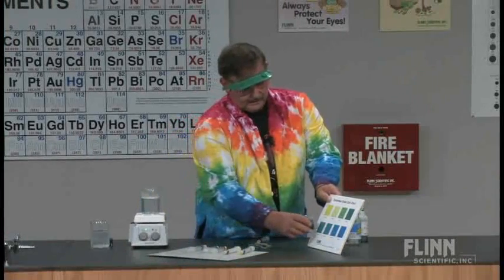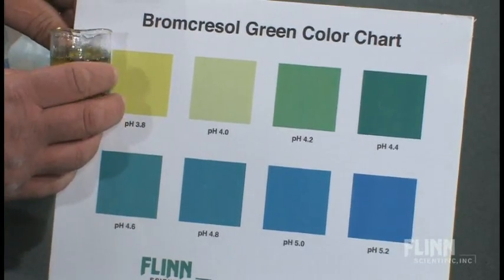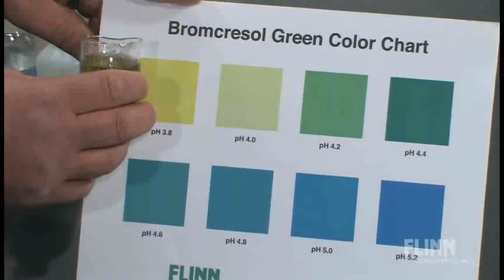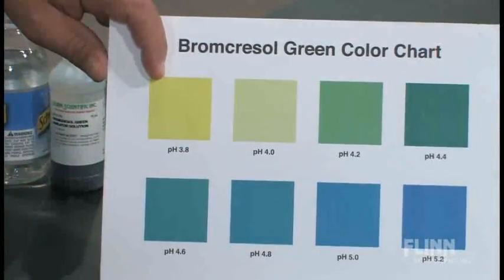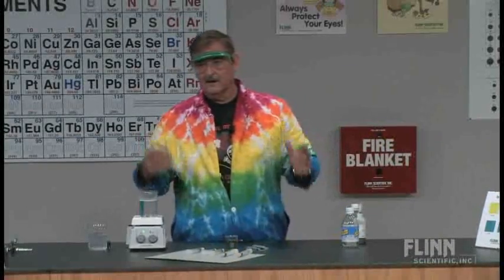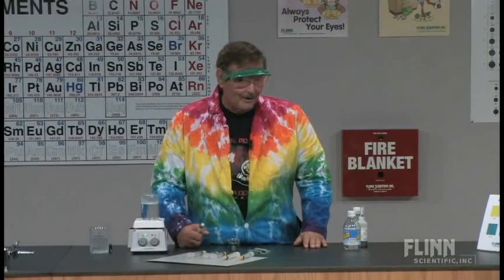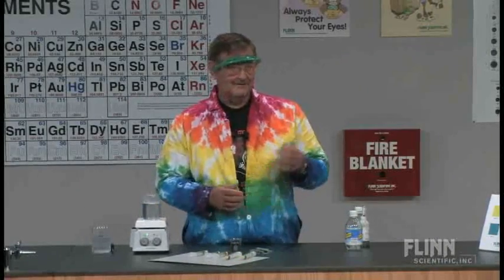If we hold it up, you can see it's not quite there but it's pretty close. So right now the pH of the seltzer water is about 3.8. And then I'm going to use syringes - and I always have to remind my students what syringes are for.